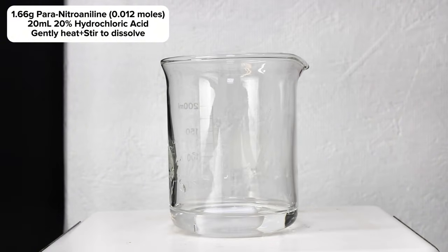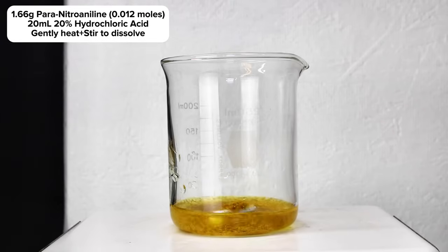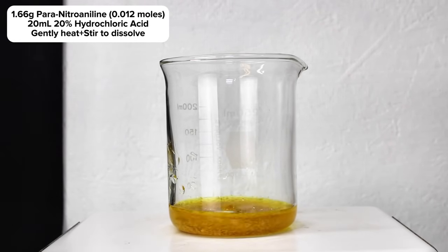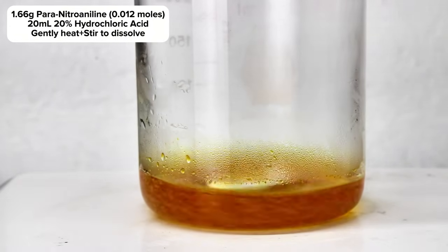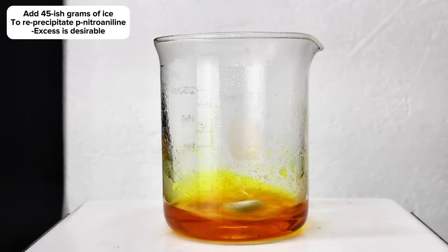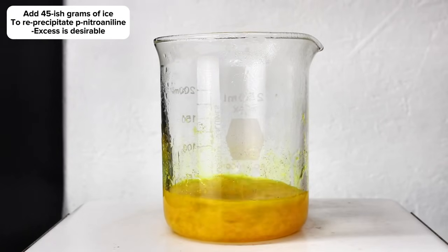To get started making Para Red, the first thing I had to do was dissolve 1.66 grams of para-nitraniline in 20 milliliters of 2 molar hydrochloric acid and carefully heat the mixture. Once the para-nitraniline was completely dissolved, I then added around 45 grams of ice, which re-precipitated the para-nitraniline as a fine suspension.